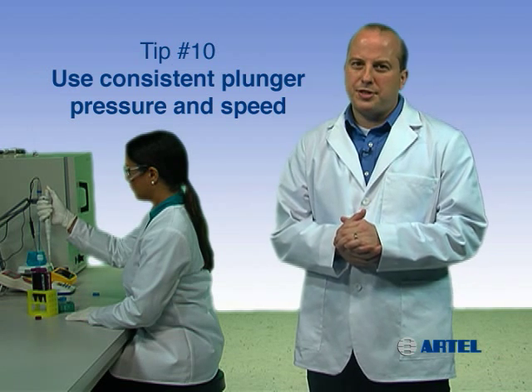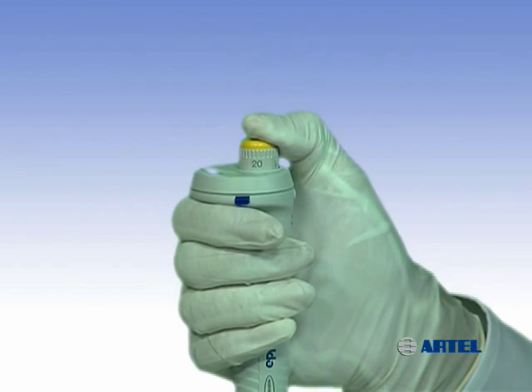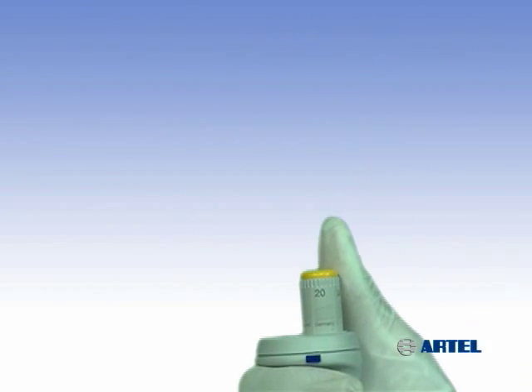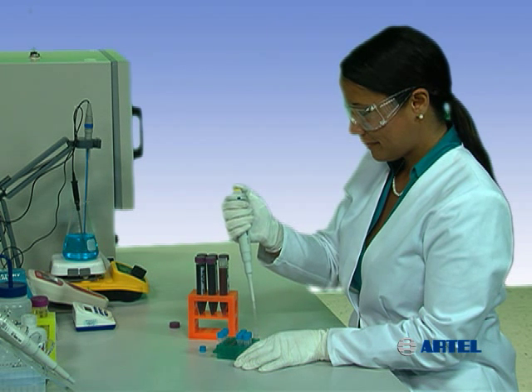Pipets, like all precision instruments, give more reproducible results when used with proper technique and when the user is paying attention to detail. It's important to have constant steady plunger movement during sample aspiration as well as during sample delivery and transfer, because inconsistencies in the technique will allow air to creep into an assay or process.